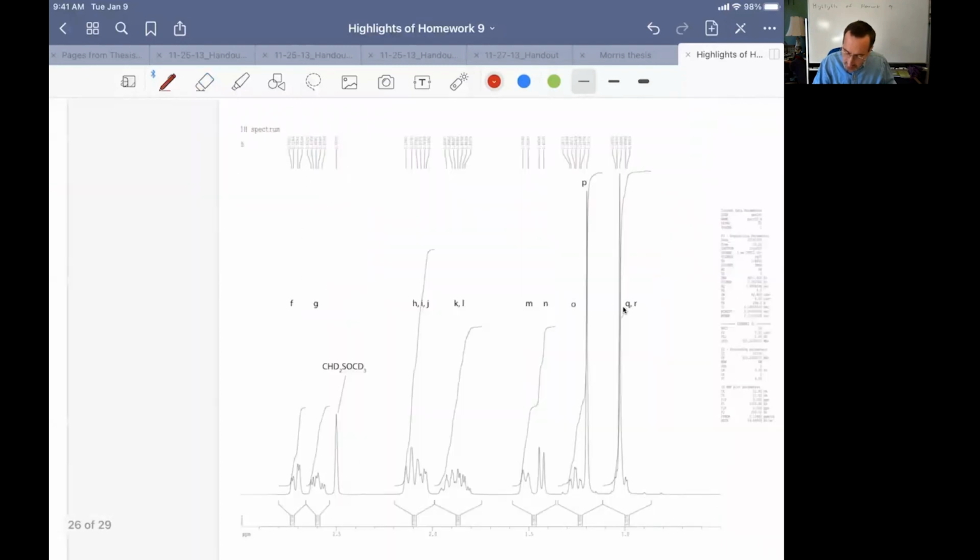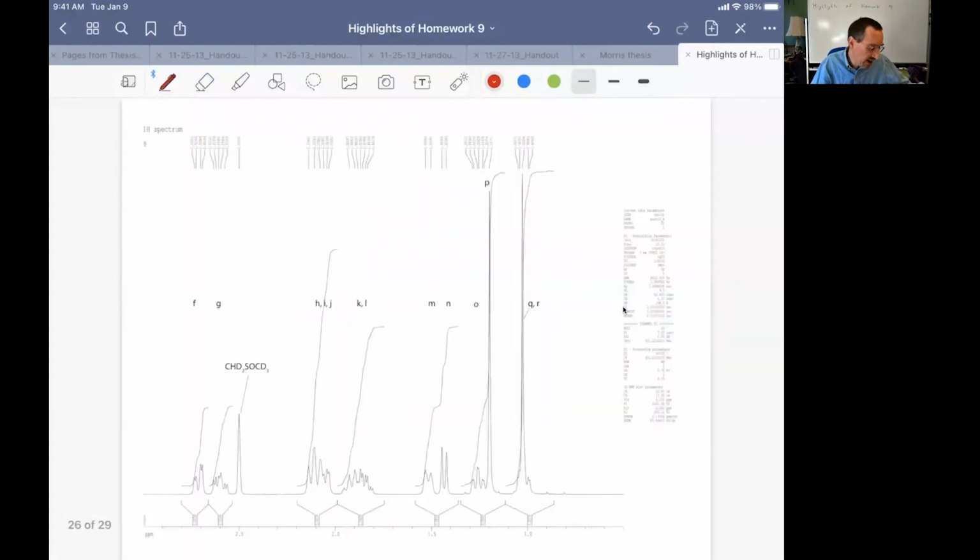ppm, so you'll have a familiar pattern as a highlight. I deliberately chose a molecule that's going to give you some severe overlap. And so the HSQC-TOCSY is going to help you out. Like many natural products, this molecule has some isolated methyls. We know what to do with isolated methyls at this point.